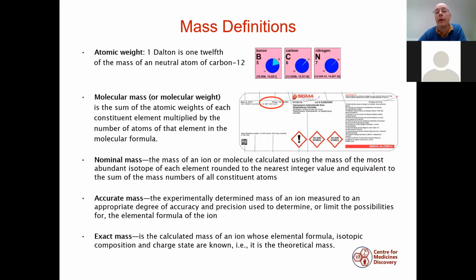And here's an excerpt from the periodic table, and you can see here we have the mass of carbon listed as a range because carbon has more than one isotope. It's roughly 1% carbon-13, and the geographical abundance of those isotopes is represented in this figure.